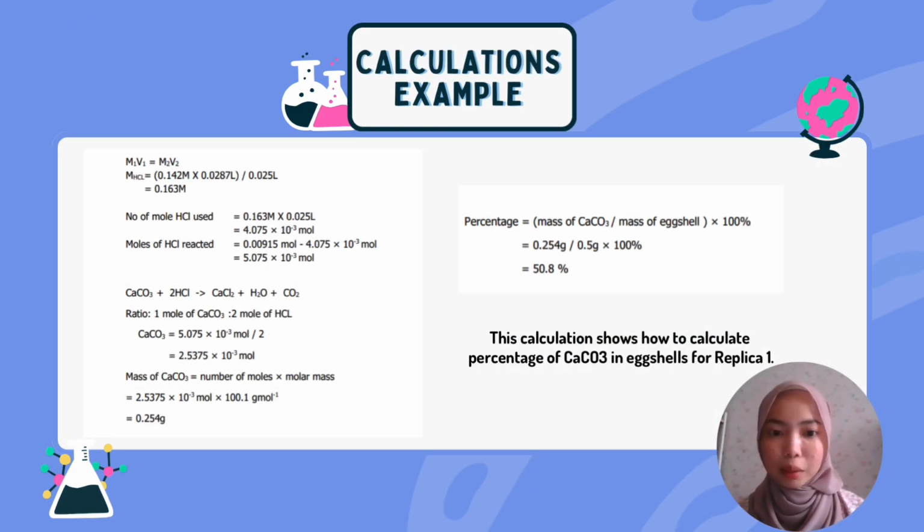For the calculation example, we choose to show how to calculate the percentage of calcium carbonate in eggshells for replicate 1. First, we have to use the formula M1V1 equal to M2V2, and then we also have to find out the number of moles of HCl used and reacted. From using equation 1 from the back titration, we can also find the number of moles of calcium carbonate, and from there we can calculate the mass by using number of moles times molar mass, and we will get 0.254 gram. From there we can also calculate the percentage, and the final answer will be 50.8%.